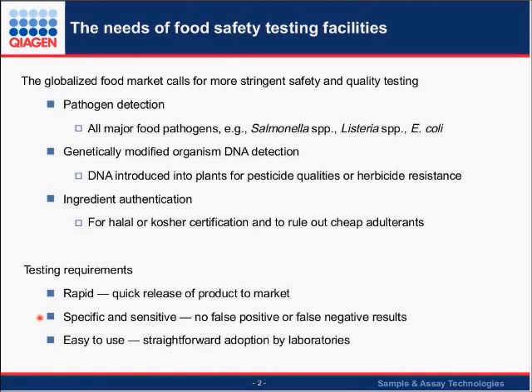The test has to be specific and sensitive, so that you get no false positive or false negative results, and you can be assured that the answer that you get is real. The test also has to be easy to use, so that it can be readily and very easily adopted by laboratories.